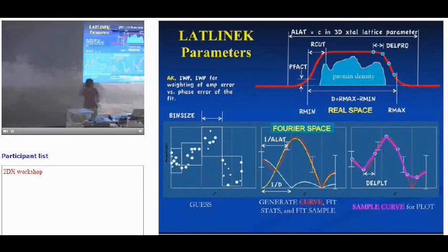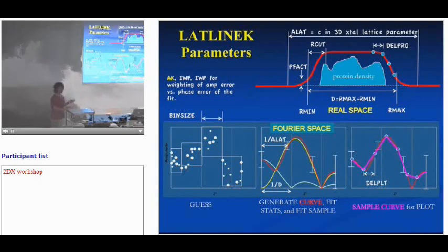Okay. So now let's come back to look at all these parameters. As I said, there are quite a few. The first set defines the envelope for the inside in real space. This will be the model you'll be using for the fitting. The first thing is, of course, the Rmin and Rmax that define the width of your envelope, and then you can apply a taper by defining these 2 numbers.